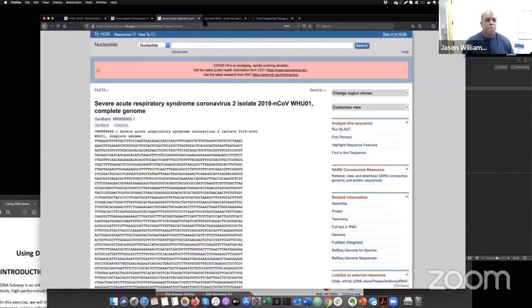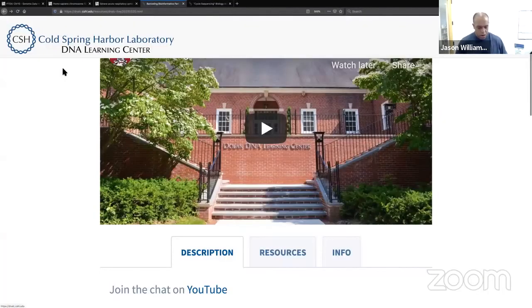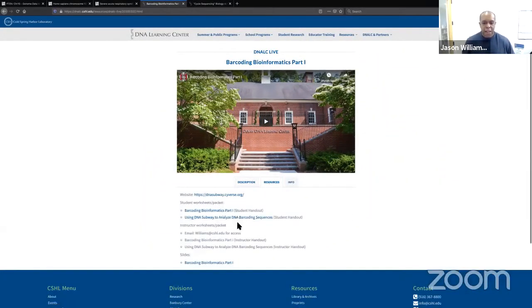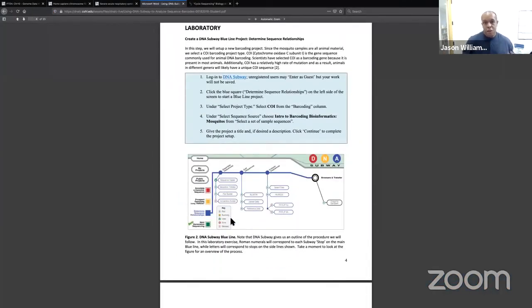Again, if you are following along, let's go one last time to the DNA Learning Center homepage. I'm really zoomed in right now. DNA Learning Center homepage, DNALC Live. This is today's broadcast, which is Barcoding Bioinformatics, and under Resources, we've got those packets. The Barcoding Bioinformatics Part 1 student handout is just for students to go ahead and take a look, and some thought questions that you could be able to complete after. The full packet you can download, and it's really where I'm about to take you now, starting on page 4. So let's go to DNA Subway, which is this tool.